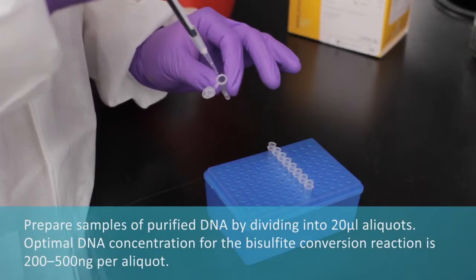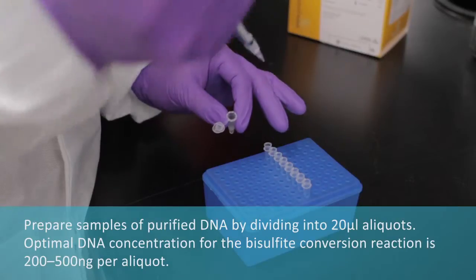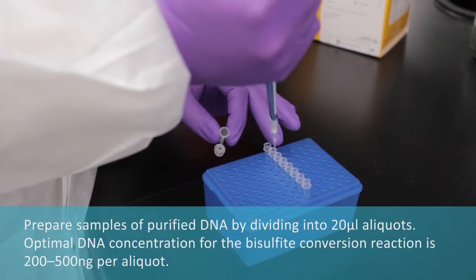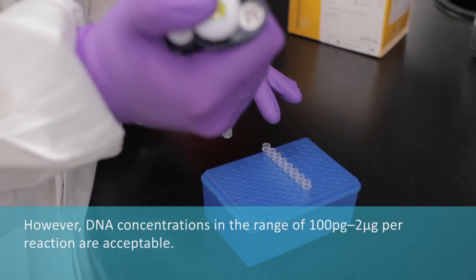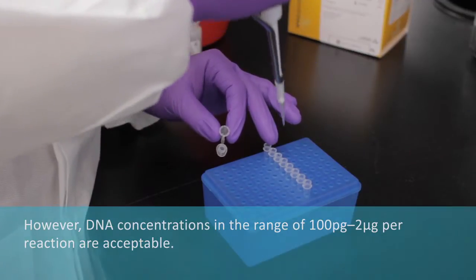Prepare samples by dividing purified DNA into 20 µl aliquots. Optimal DNA concentration for the bisulfite conversion reaction is 200 to 500 ng per aliquot. However, DNA concentrations in the range of 100 pg to 2 mcg per reaction are acceptable.